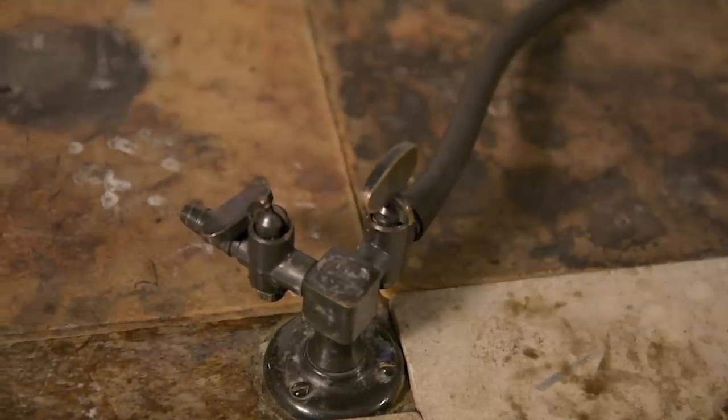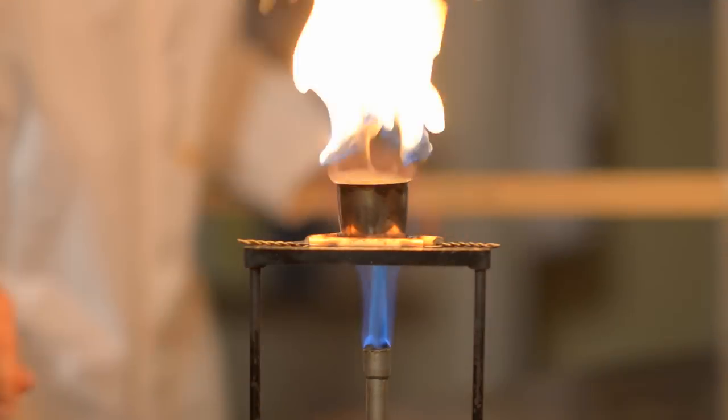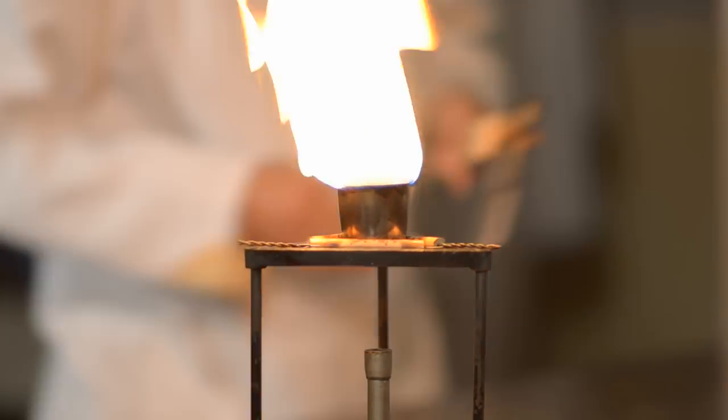When you're ready to do the demo, heat the oil for a few minutes until the vapor ignites. Once it's burning, switch off the Bunsen burner, then stand well back and use the meter rule to pour water onto the burning oil.